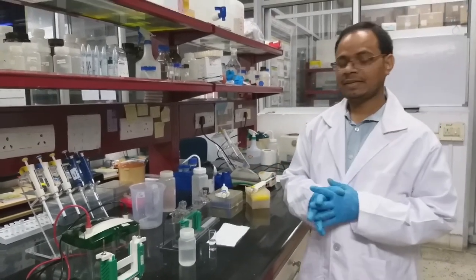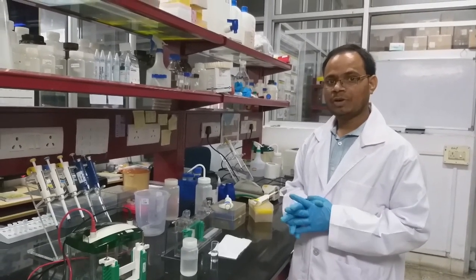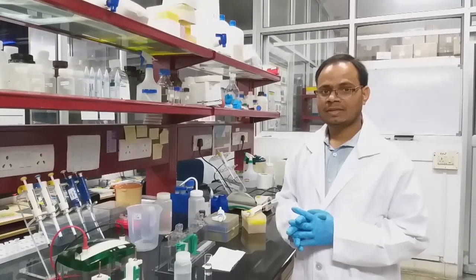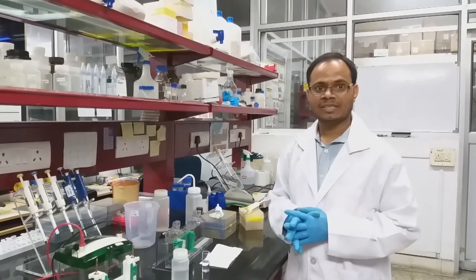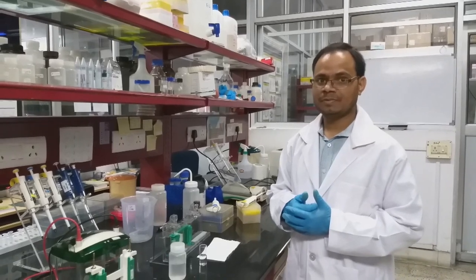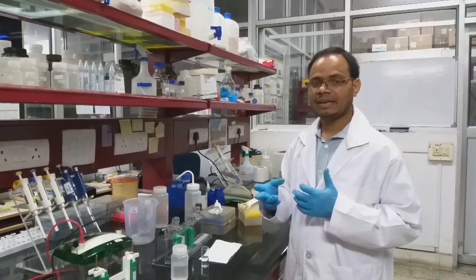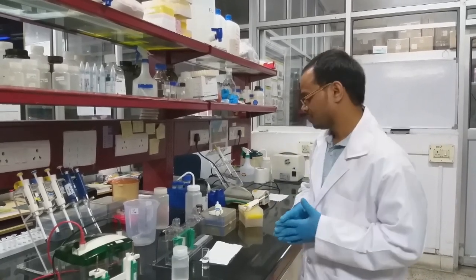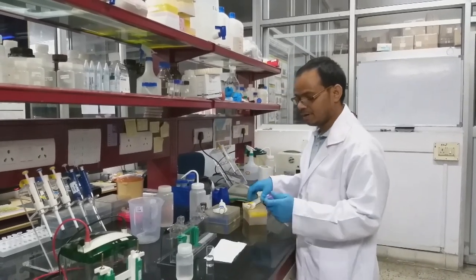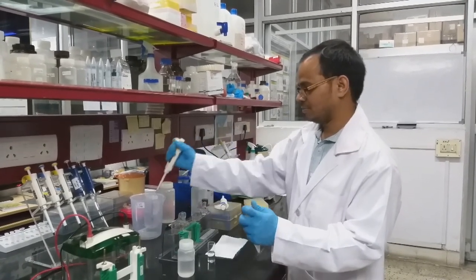The other important thing is 10% ammonium persulfate. Ammonium persulfate, which is catalyzed by the TEMED, provides free radical species which accelerate the forming of the mesh-like structure in the acrylamide gel. Like it will catalyze forming the mesh. So this is the 10% APS. I just add 100 microliter of 10% APS to the resolving gel.